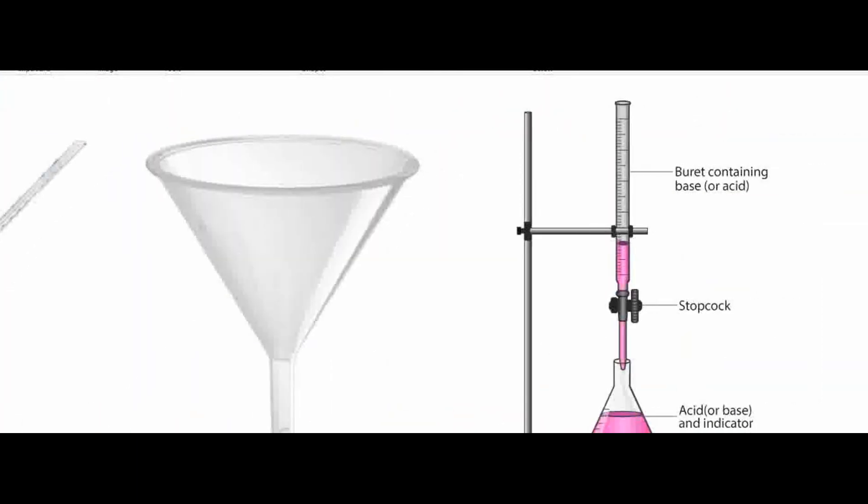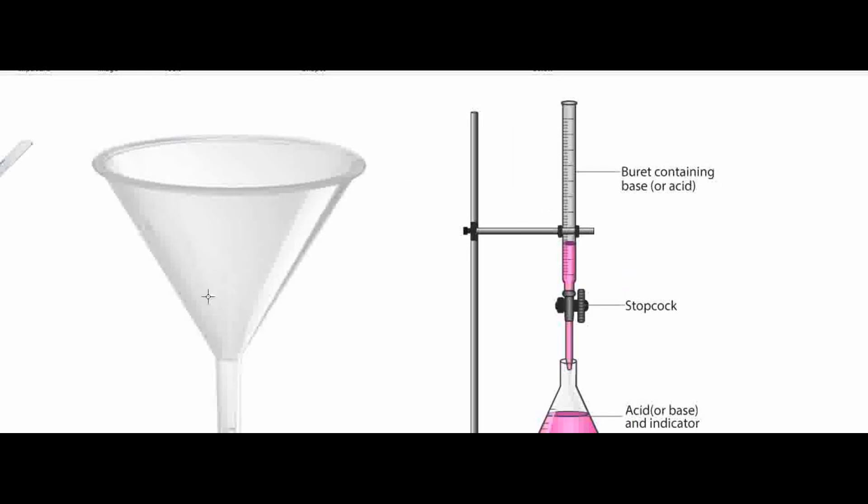We will place the acid in the burette and we would do that using a filter funnel. This will help to make sure that there's no spillage of the acid. You remove the filter funnel after you have placed in the acid because you don't want any excess acid dripping from the funnel and messing up the volume reading on the burette.